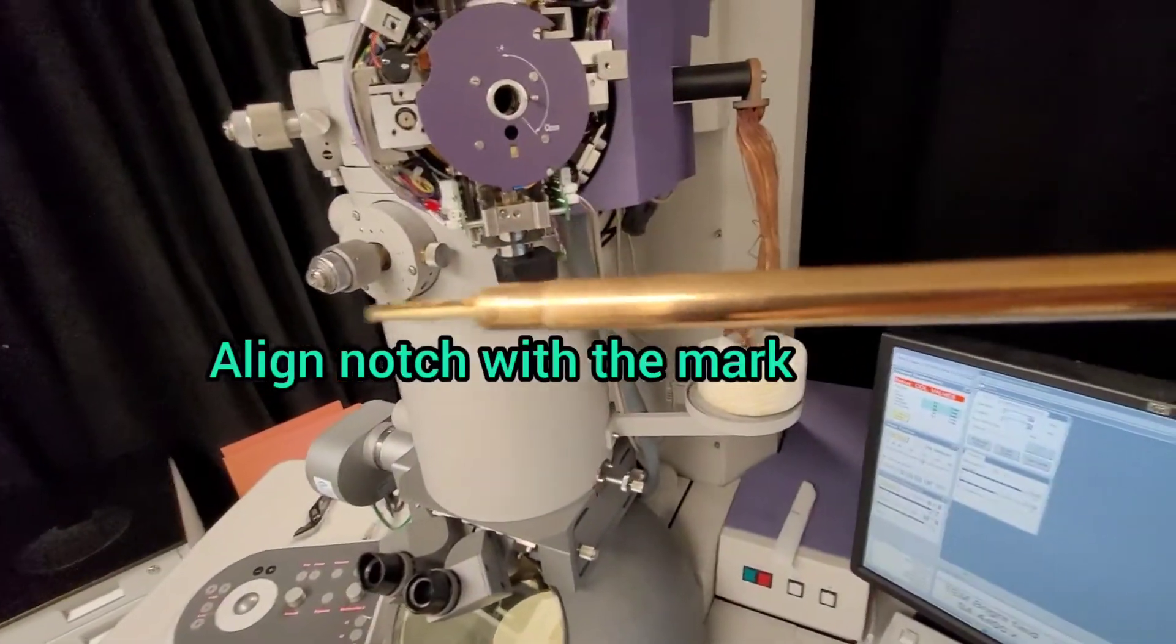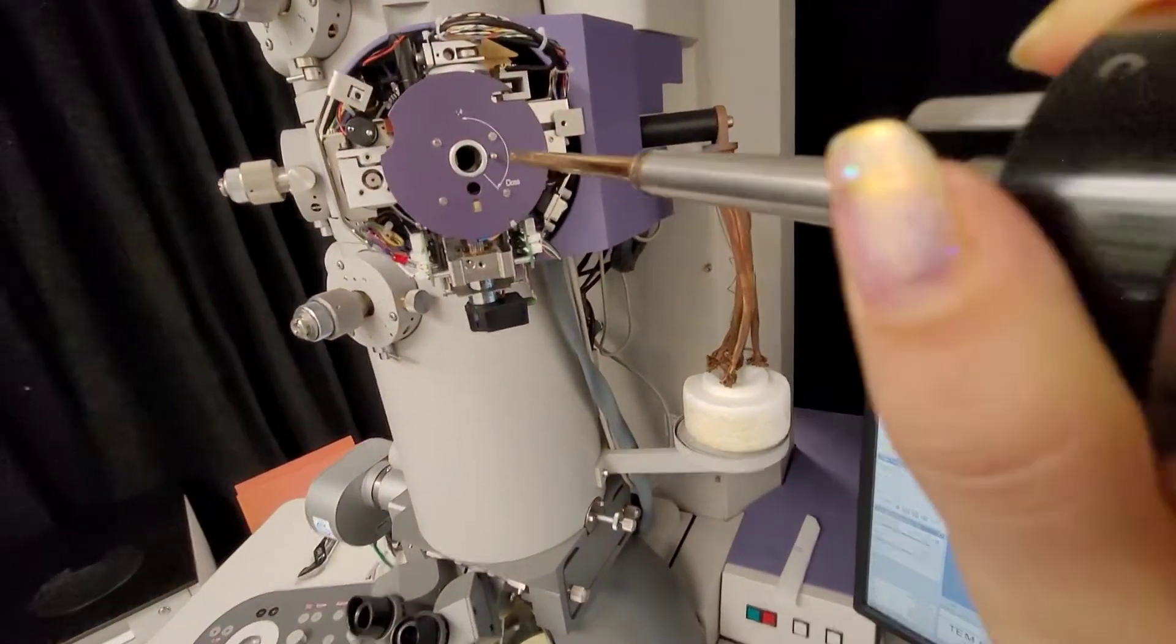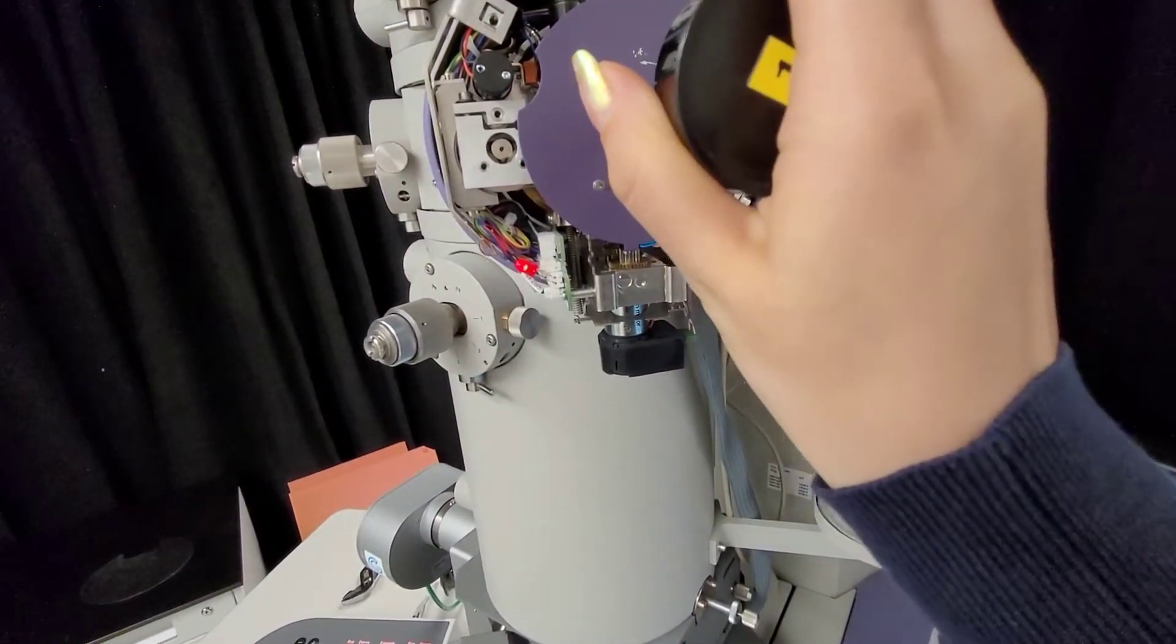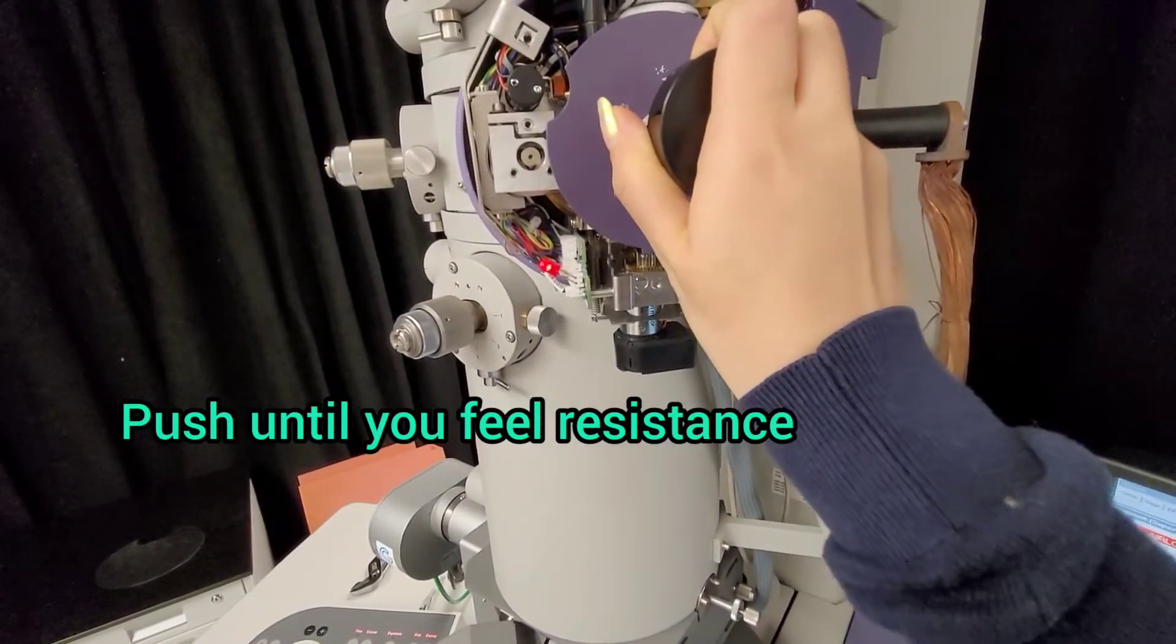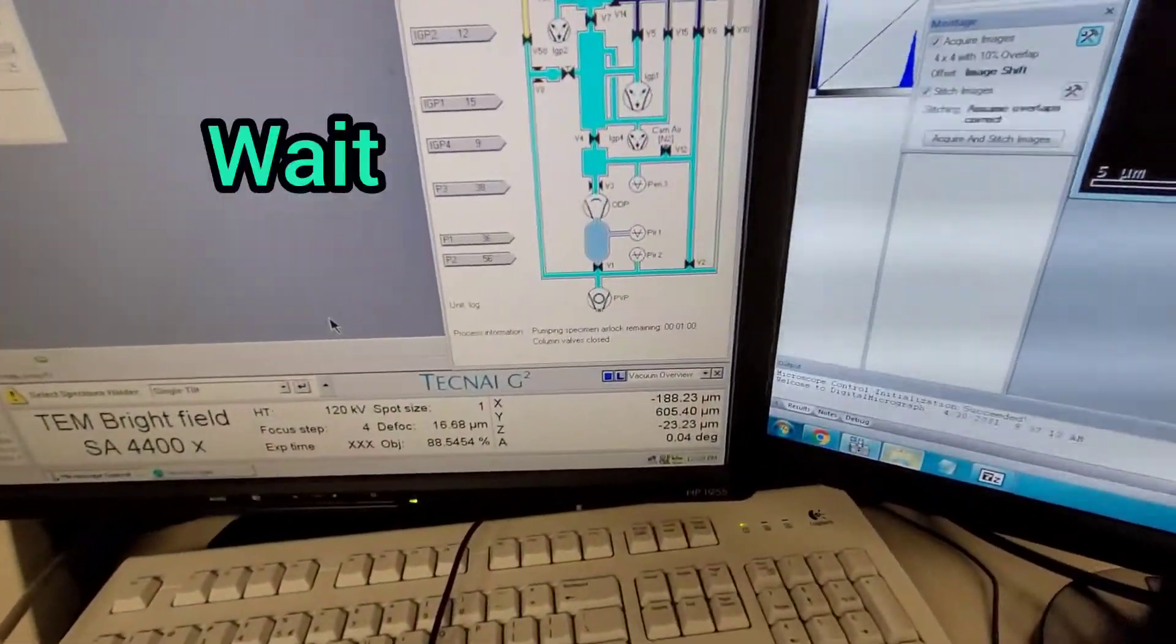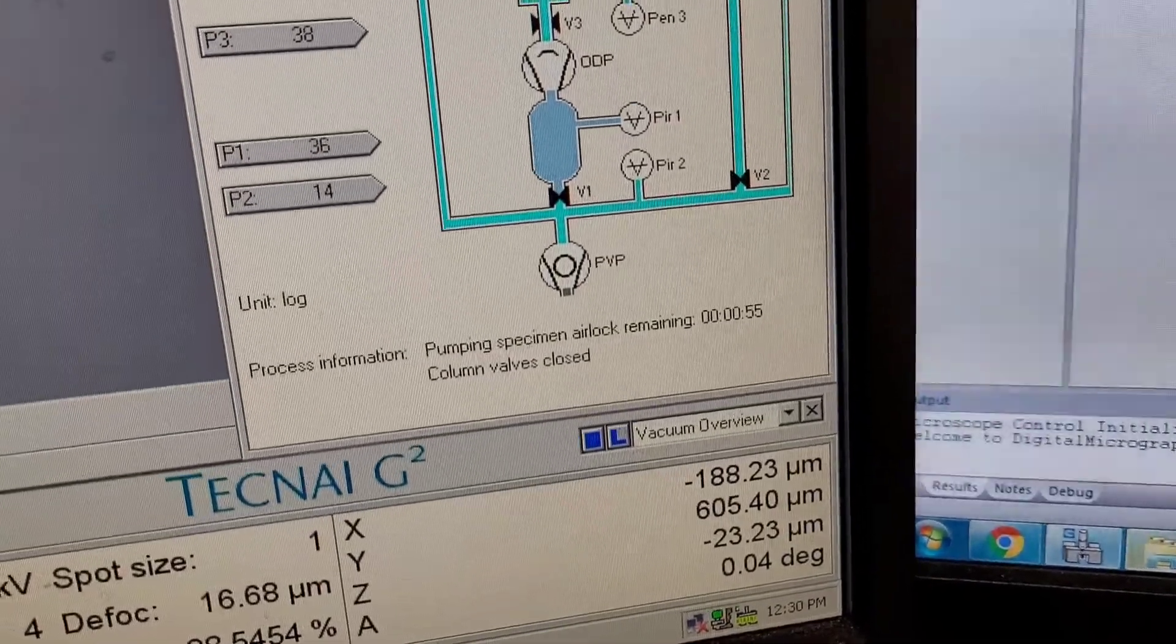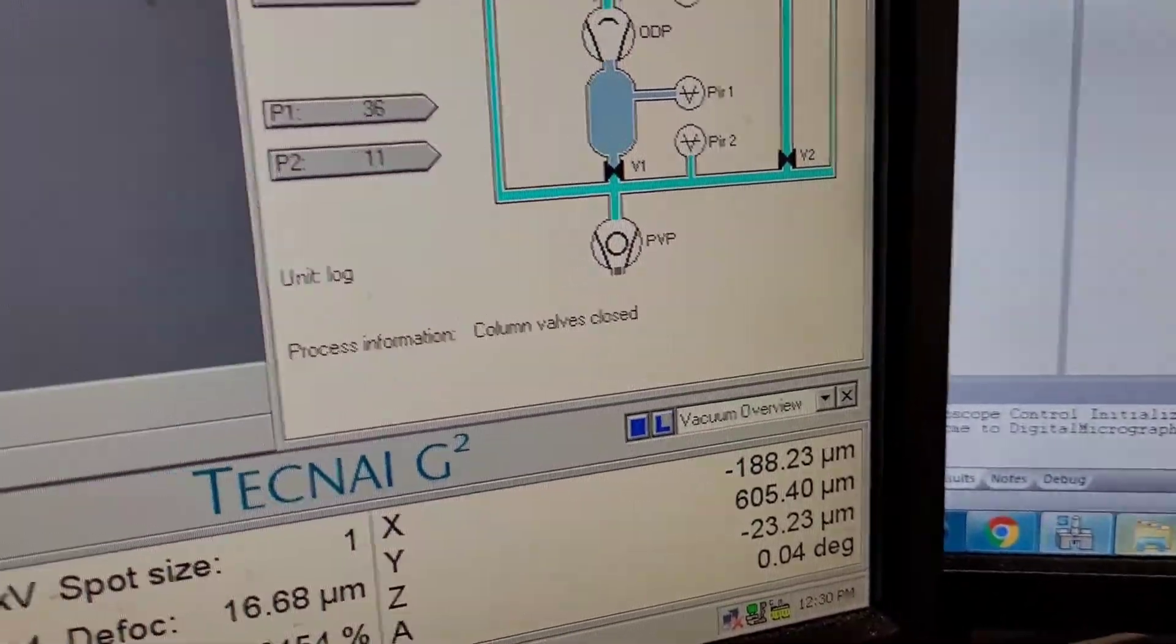It has this little notch in the bottom. You want to stick it inside the microscope with the notch aligned with the little mark. Then you just place it there and push it in as hard as you can so it clicks a little bit. Then you wait until the pump finishes.